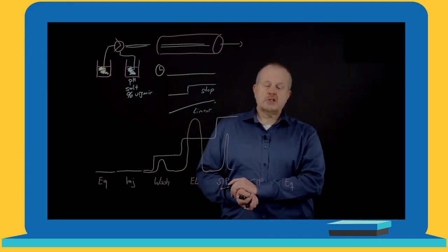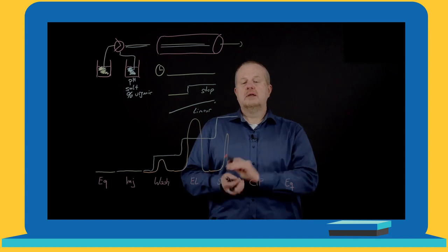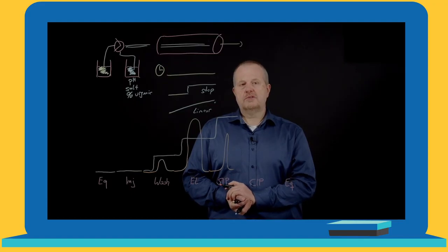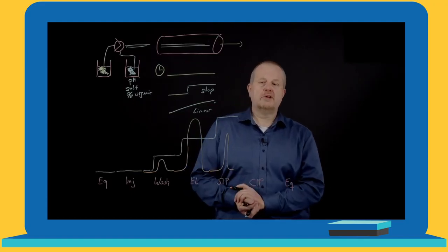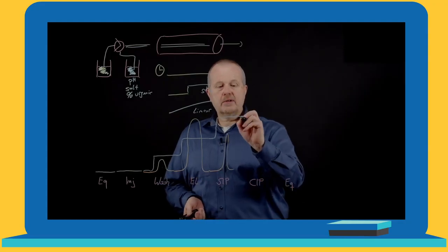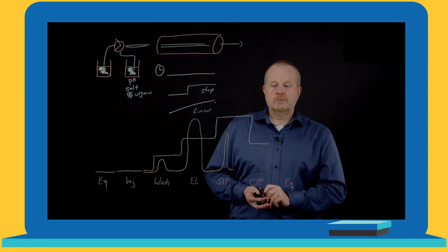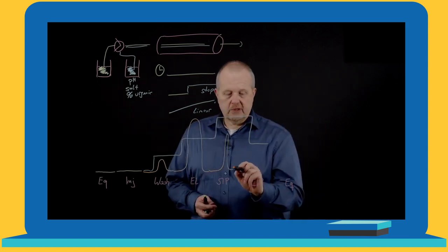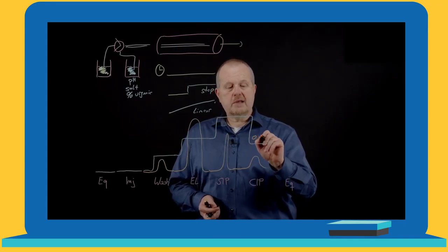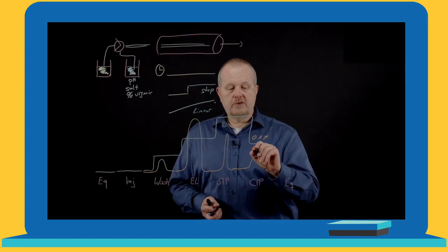In case of biological systems, we often increase then again the elution power, but now by introducing caustic, so sodium hydroxide, for example. And with that, we clean out every material which might foul our column. You will not see a lot of material coming off here. And typically this is something which is using, let's say, 0.1 molar sodium hydroxide.